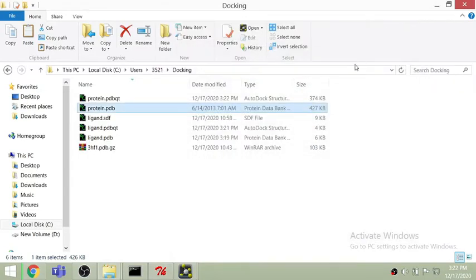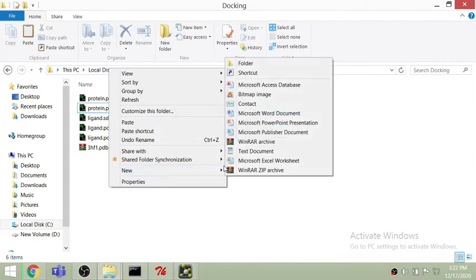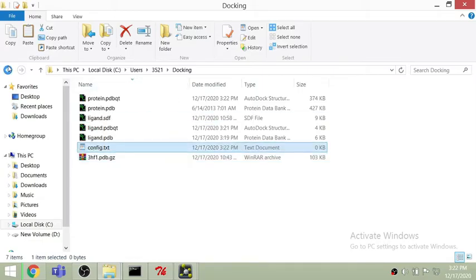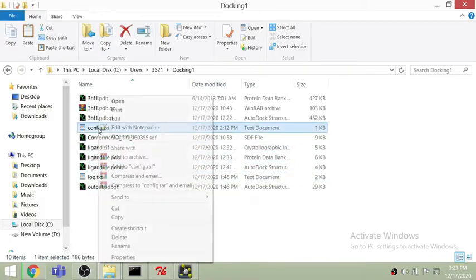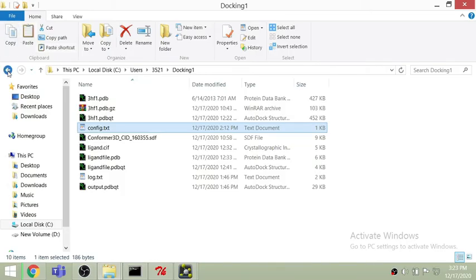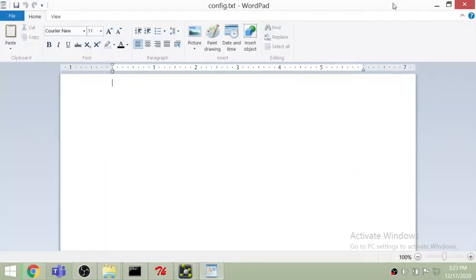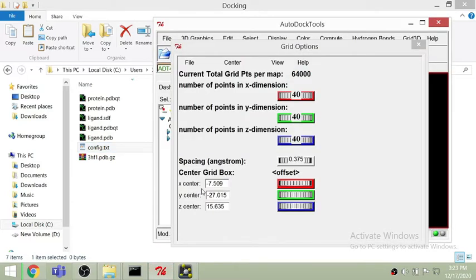This is the configuration we will use for docking the ligand with the protein. What we have to do is make an input configuration file with these x, y, z axis values. I have already made this file — I'm just showing you how you need to make it. I'm copying the file and opening it so you can understand.